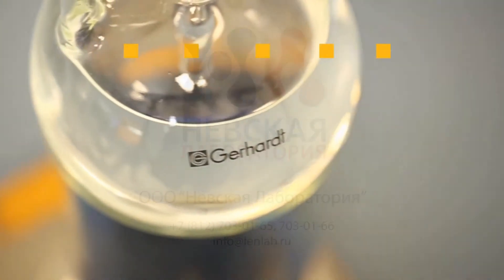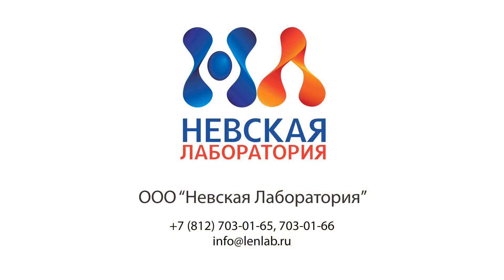VapoDest, a premium product from Gerhardt, best in class for Kjeldahl analyses. Please visit our website.